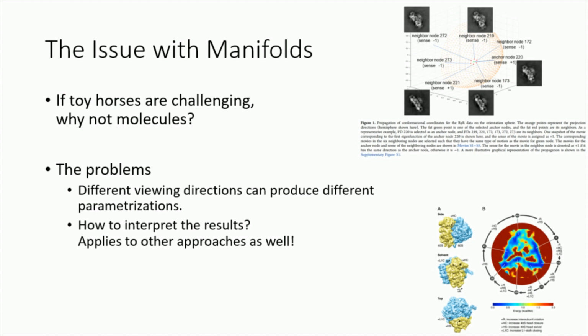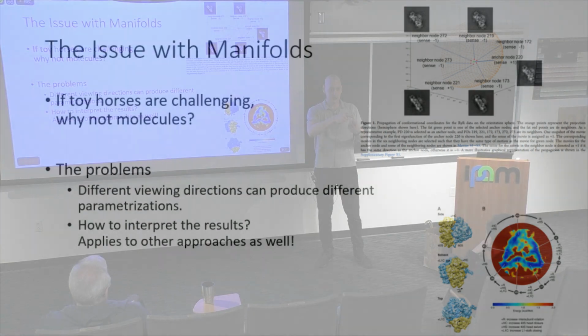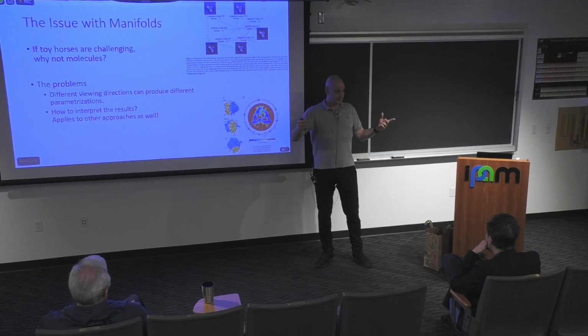At the end, we try to get a manifold with densities and say, okay, there is this dominating state here, there is that dominating state there. We're trying to find this landscape from the map that we infer from basically all the algorithms that we've seen. And these maps can come from, for example, a variational autoencoder. What's the metric there? I don't know. And on top of this, maybe we're doing UMAP or something for dimensionality reduction.